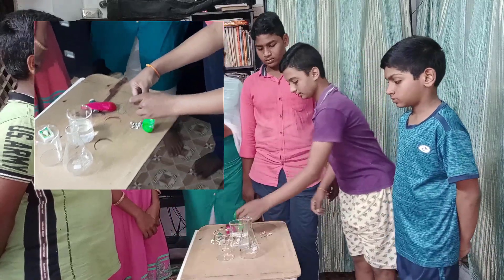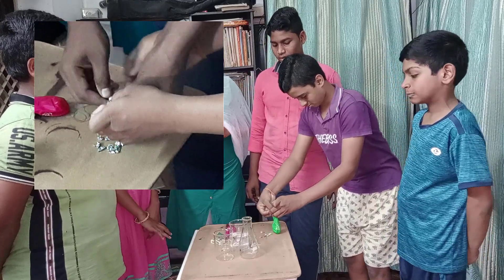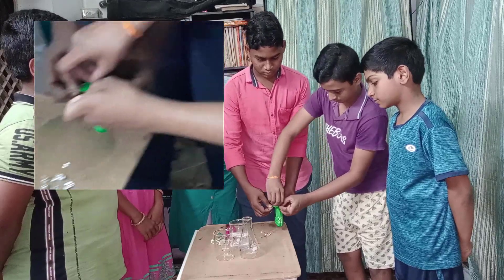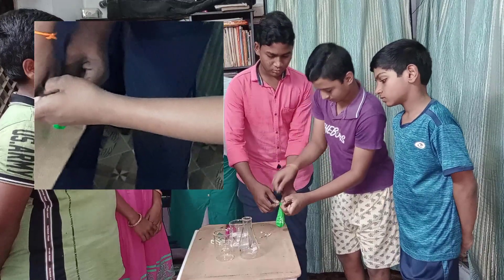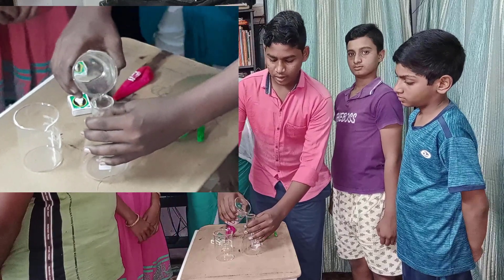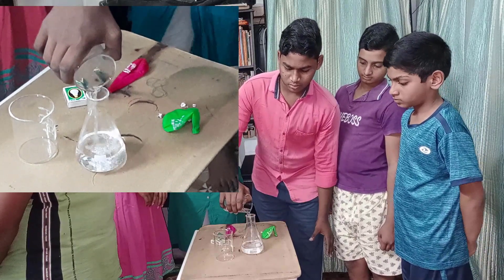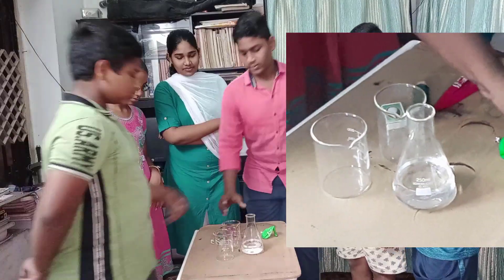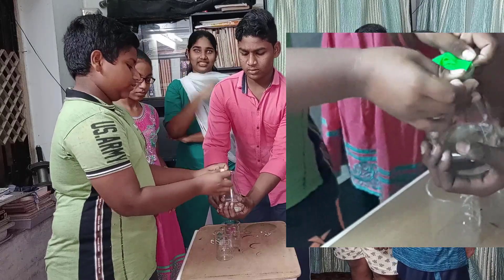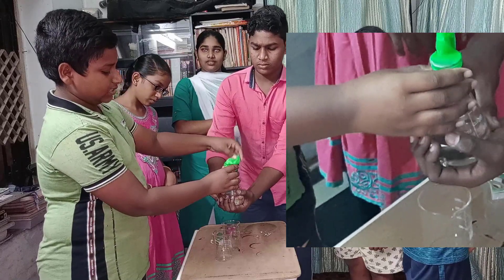Procedure: Take a balloon and fill the zinc crystals in it. Pour the dilute sulfuric acid into the conical flask. Attach the balloon to the conical flask, and drop the zinc crystals into the conical flask.